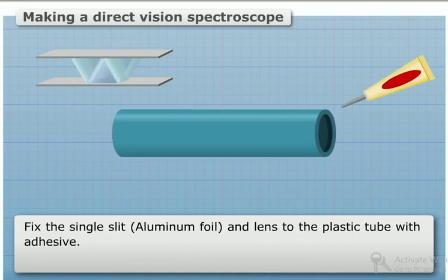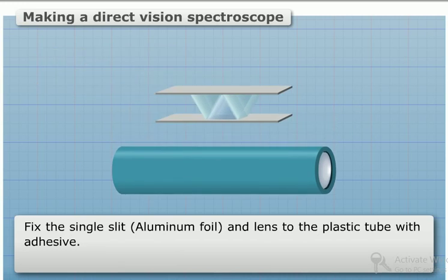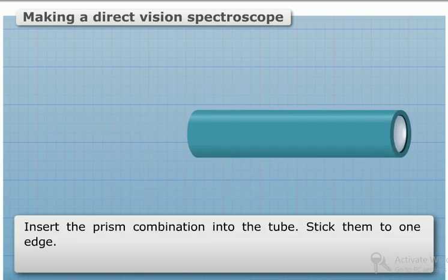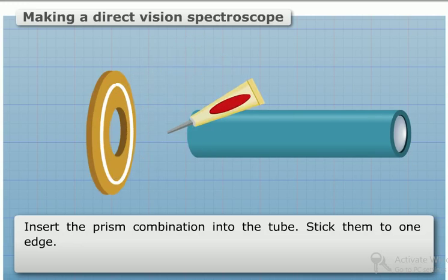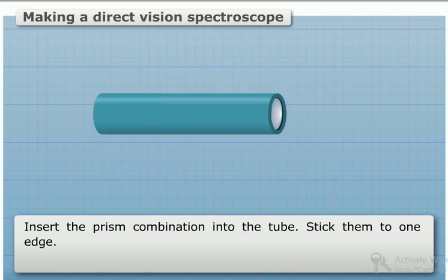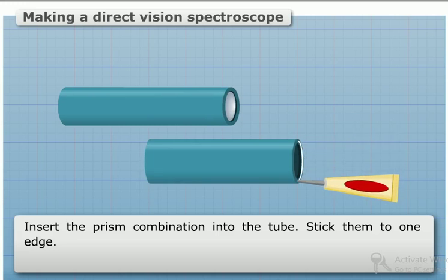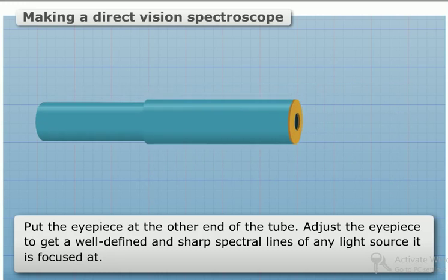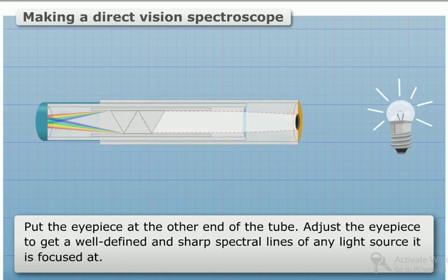Fix the single slit and lens to the plastic tube with adhesive. Insert the prism combination into the tube and stick them at one edge. Put the eyepiece at the other end of the tube. Adjust the eyepiece to get well-defined and sharp spectral lines of any light source it is focused at.